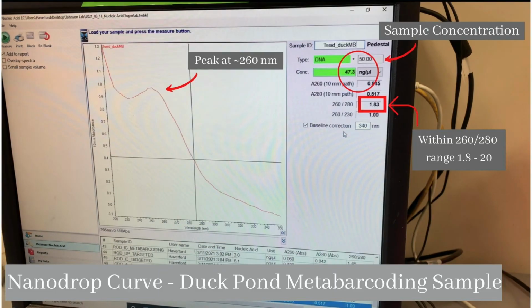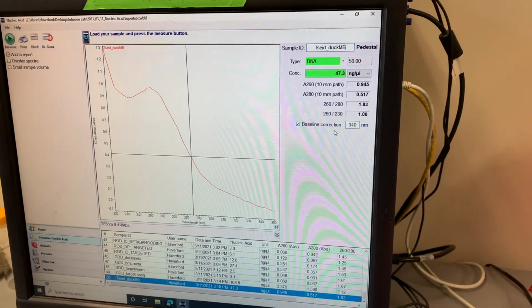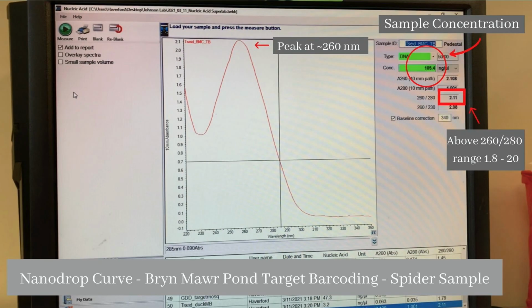So looking at the duck pond metabarcoding sample, we can see there's DNA present as there is a peak at 260 nanometers. The Bryn Mawr pond target barcoding sample, which was a crushed spider, had a very strong DNA presence as there is a large peak at 260 nanometers.